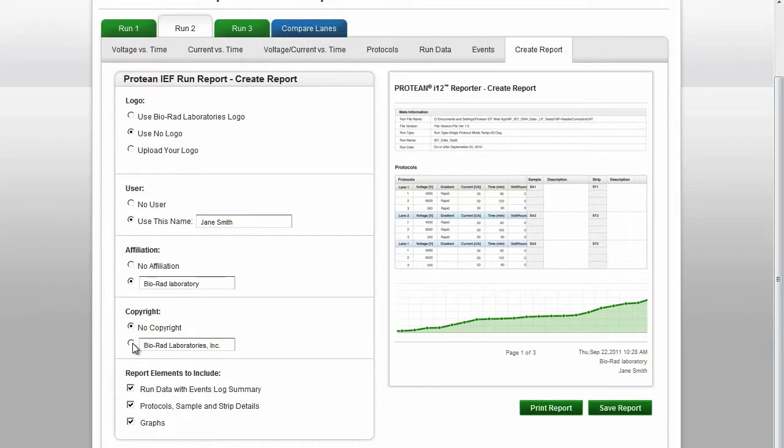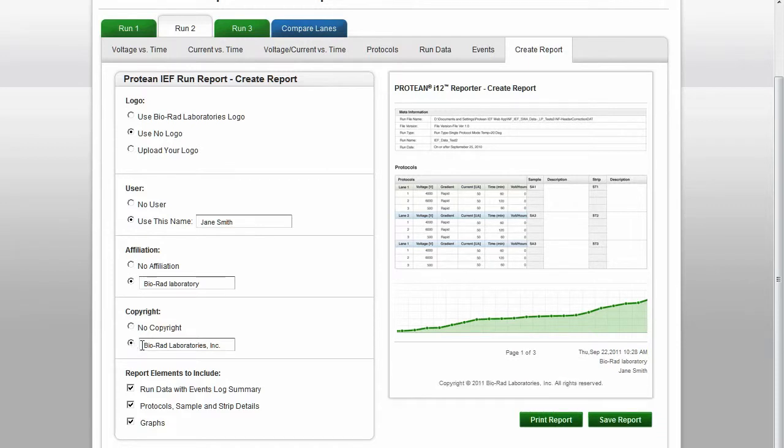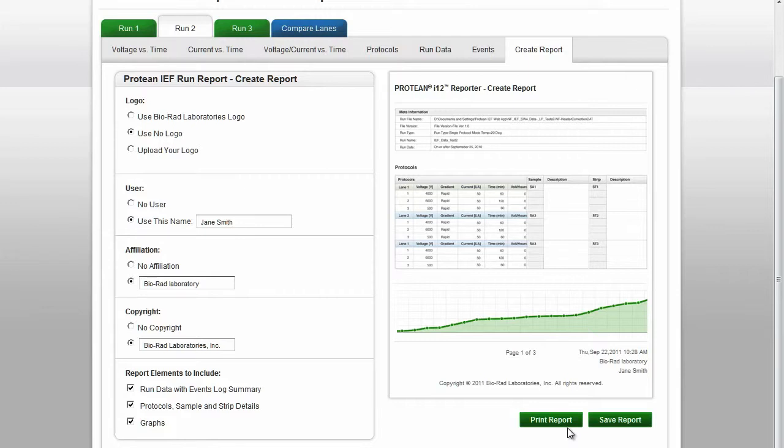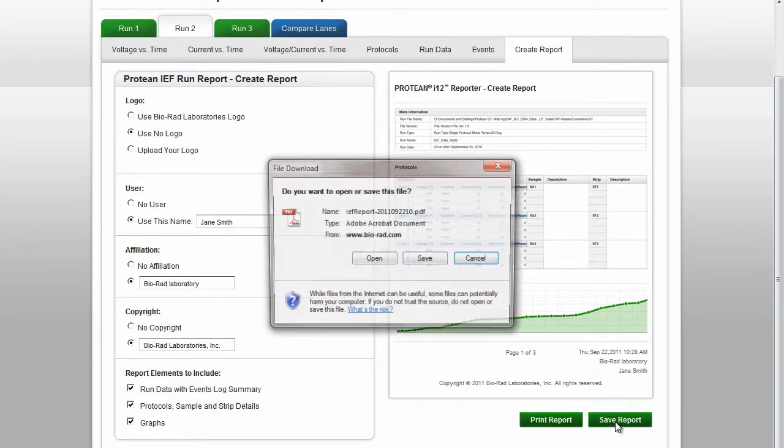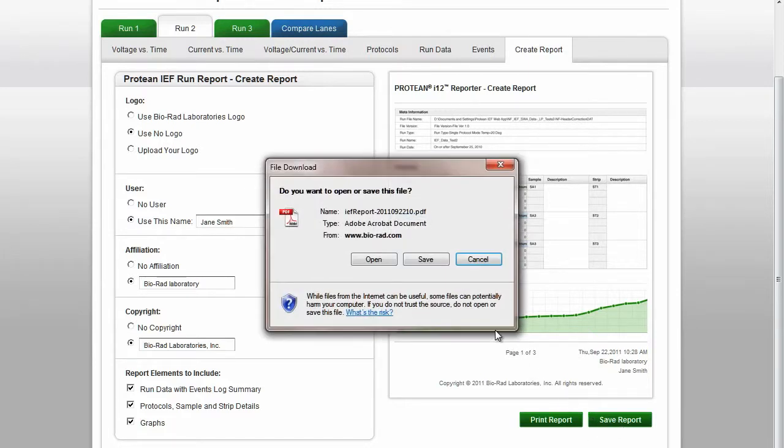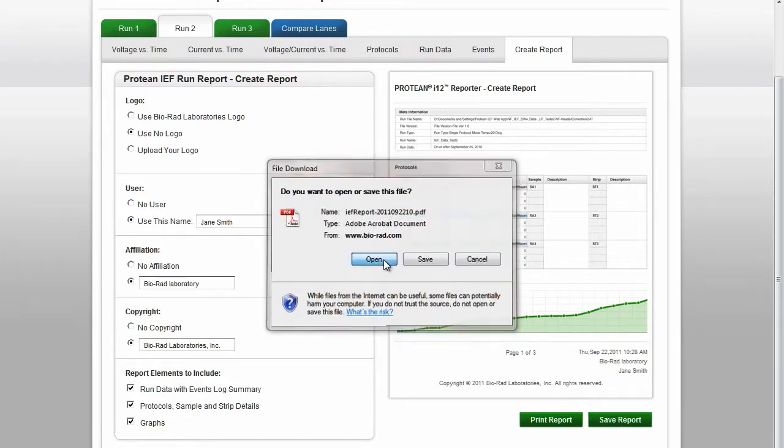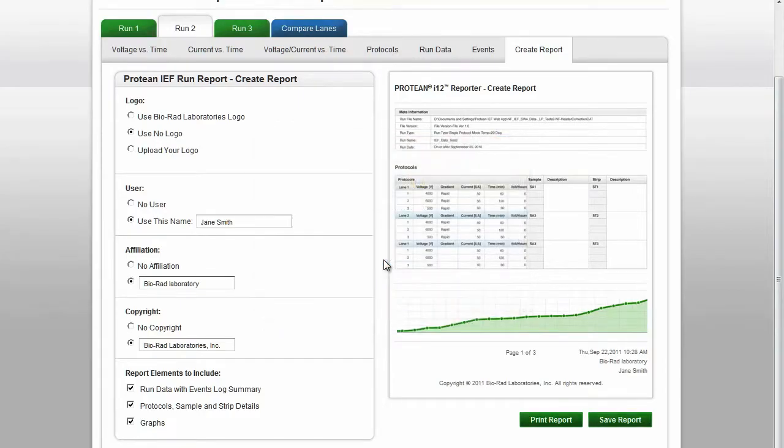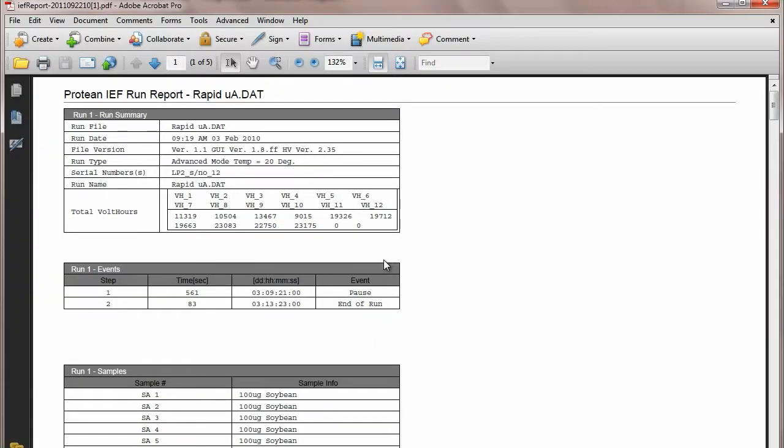You can choose to add an affiliation and copyright. You can select which report elements you would like to see: Run Data with Events Log Summary, Protocols Sample and Strip Details, and Graphs. Once you have decided what you want to include in your report, click on Print Report or Save Report. This is an example of what your report will look like.